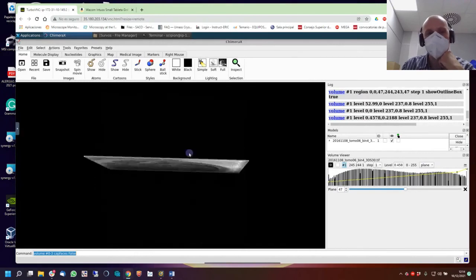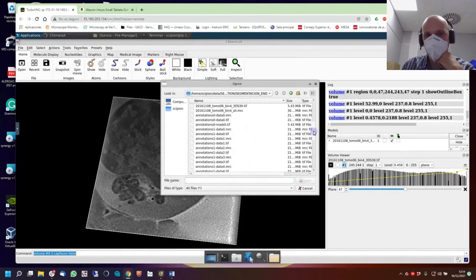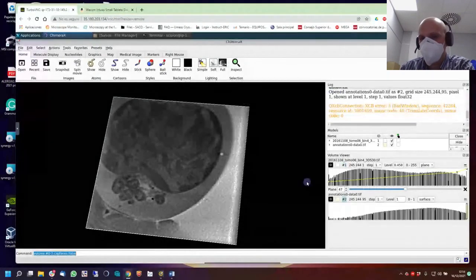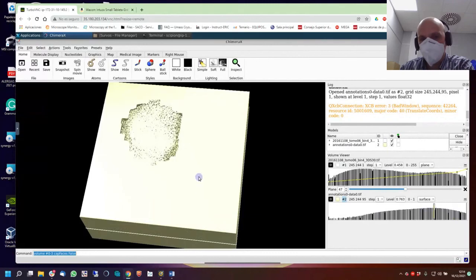So now let's open the masked one. Open. We are going to use 0, 0 will be the cell. I think at some point I managed to close the whole model, and therefore I only had boxes anymore. No, I think that this is just visualization. It's a matter of visualization. So go for it. Now you should have 2 here and here. Yeah. In the second one, nothing is visualized. It's in yellow here. But we will have this, and we don't want to visualize this thing.